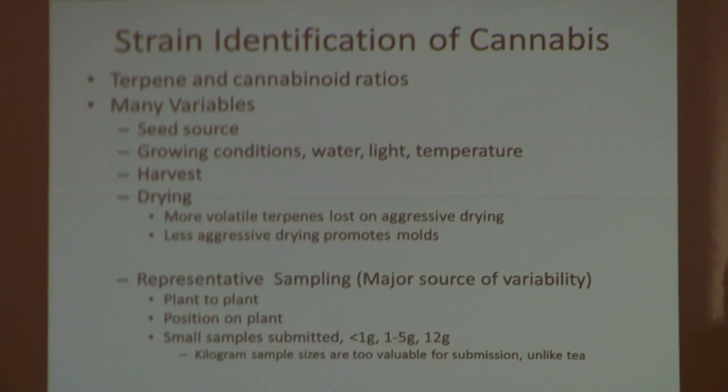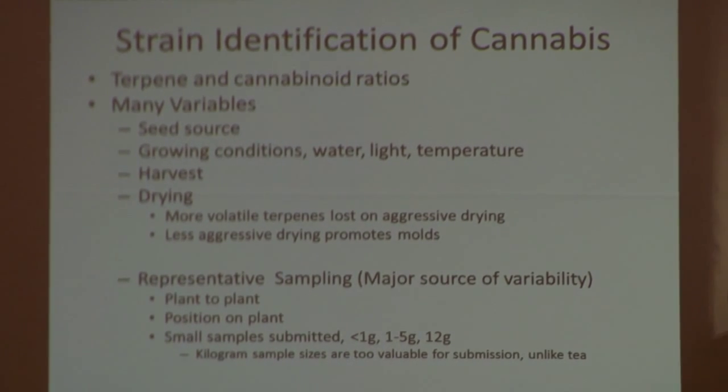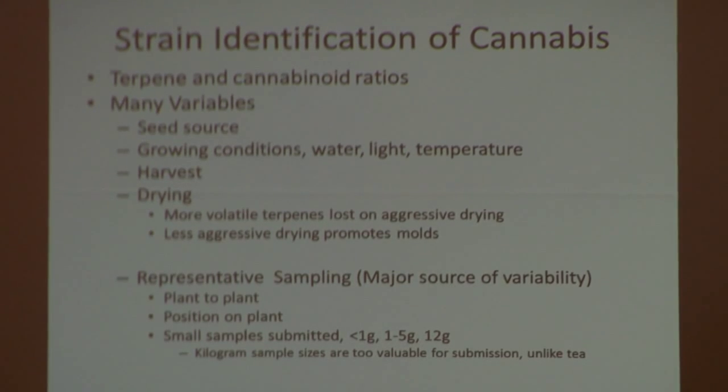Now, strain identification is something that's becoming very, very interesting to many customers. The terpene and cannabinoid ratios will have some unique type of effect on the patient.